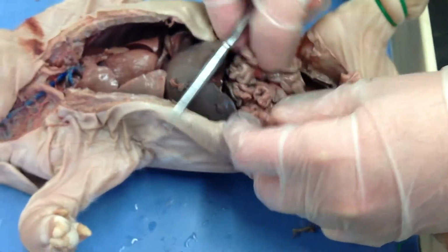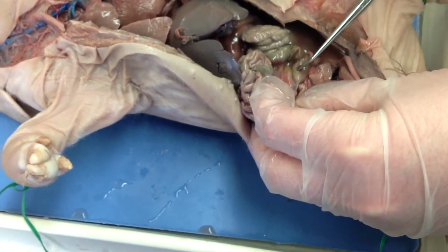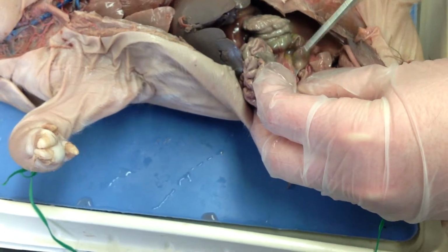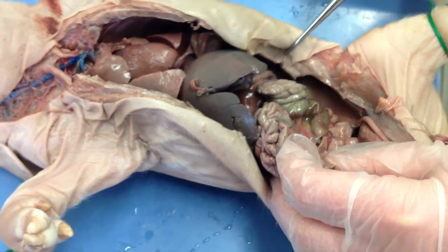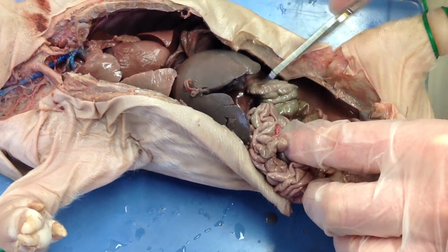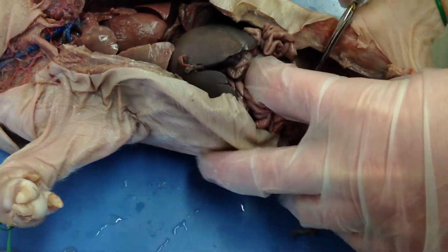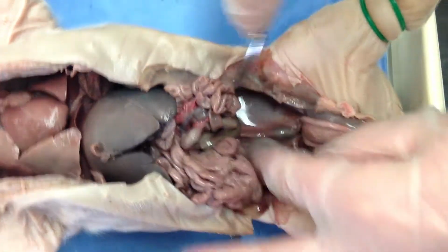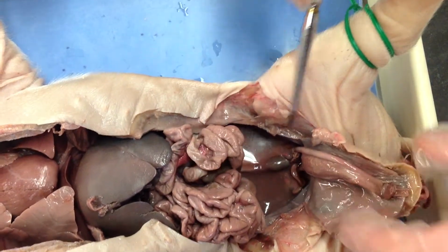First part of the large intestine where the two meet. Okay, here this is called the cecum, C-E-C-U-M. This is where the large intestine begins. And this is the other part of the colon or large intestine. And if you follow the colon, it descends here, and eventually it will lead into the rectum. So that would be the descending colon.